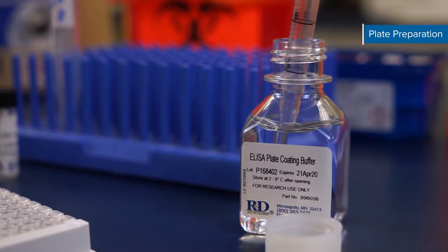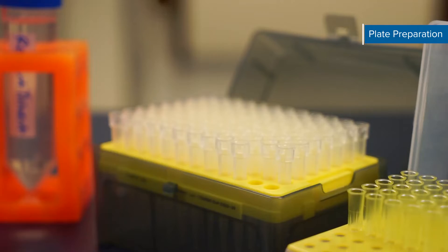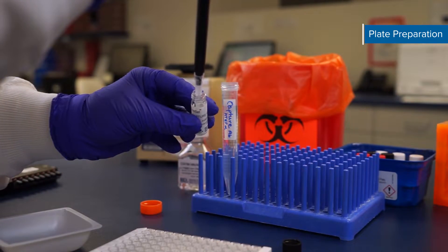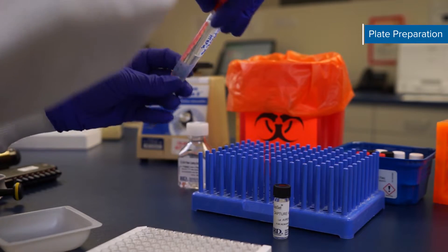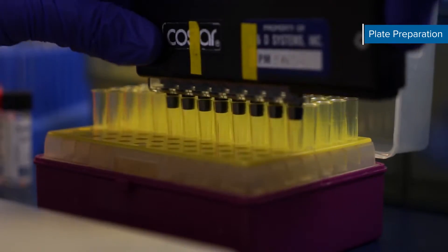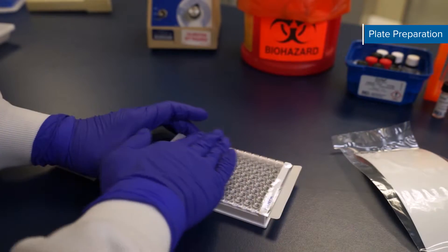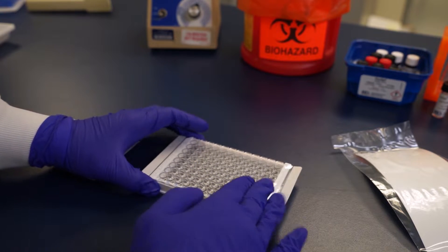Now prepare the plate. Careful and precise plate preparation is essential to good assay performance. Dilute the capture antibody to the working concentration in PBS. After gentle mixing immediately coat a 96-well high protein binding microplate with precisely 100 microliters per well. Seal the plate and incubate overnight at room temperature.